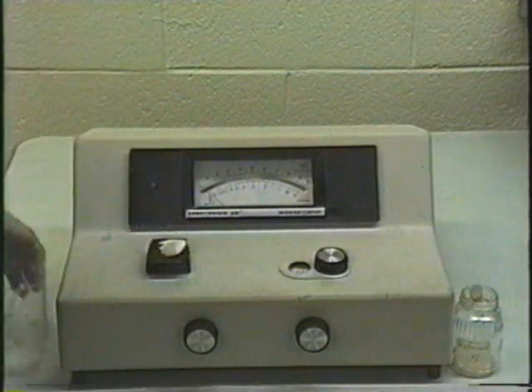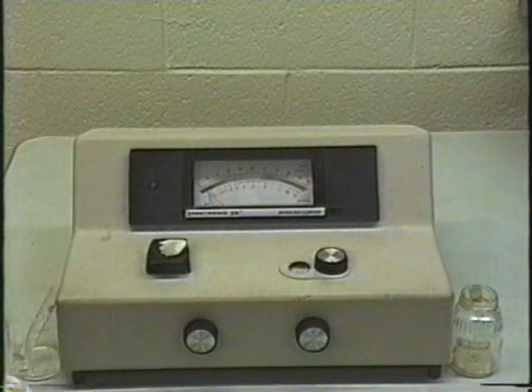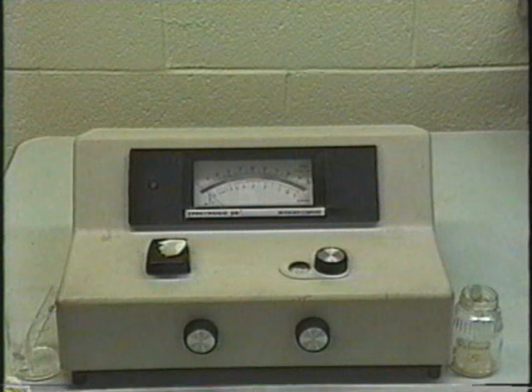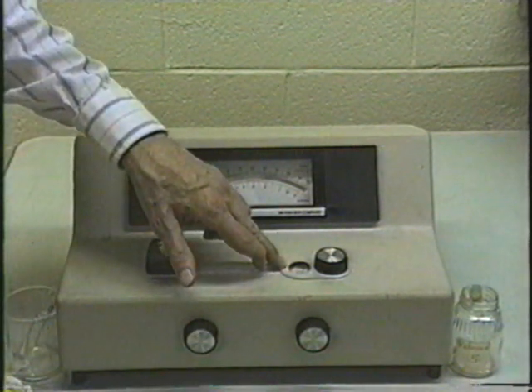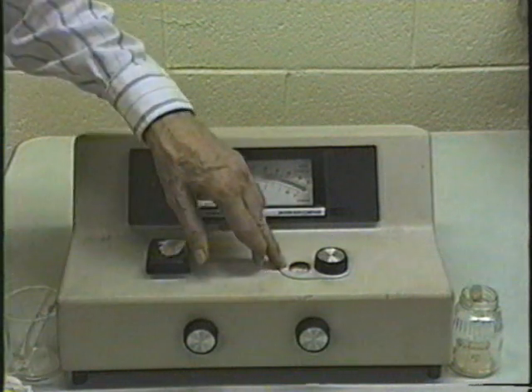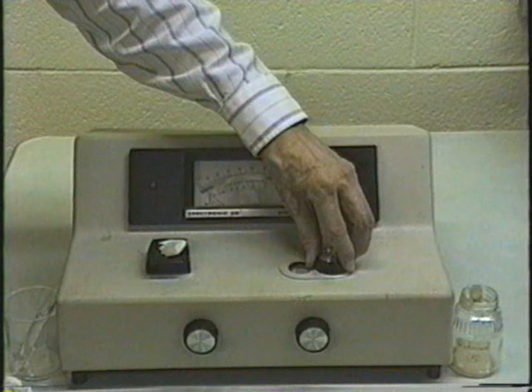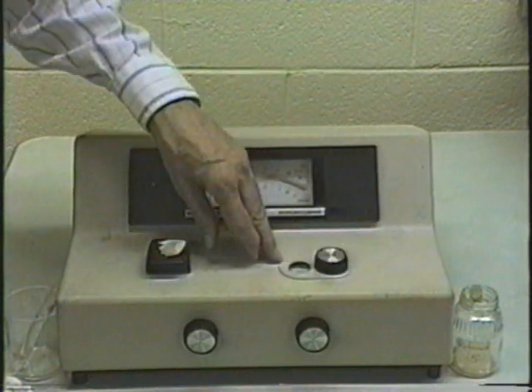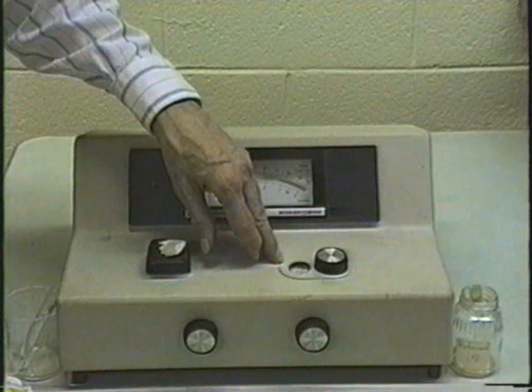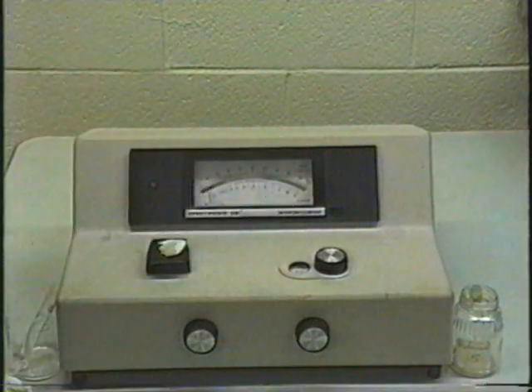You should also bring in a paper towel so that you can wipe the cuvette off before you put it in the spectrometer. Now, the first thing you do when you get to the spectrometer is make sure that the wavelength is set at 625 nanometers. To do that, you can twist this knob if it is not set right. And even if you have set it once, make sure you check it each time you use it because someone else may have accidentally readjusted this thing.